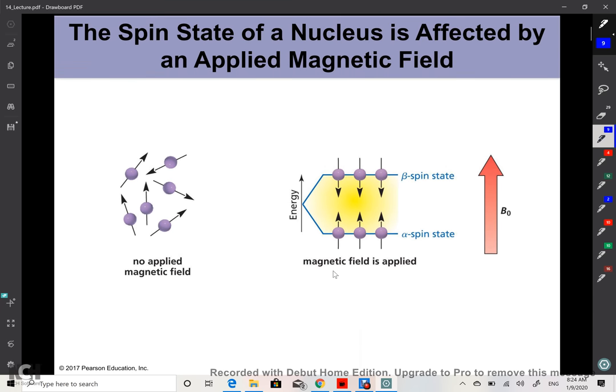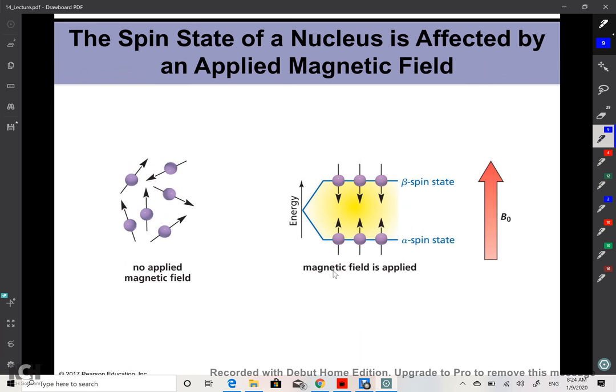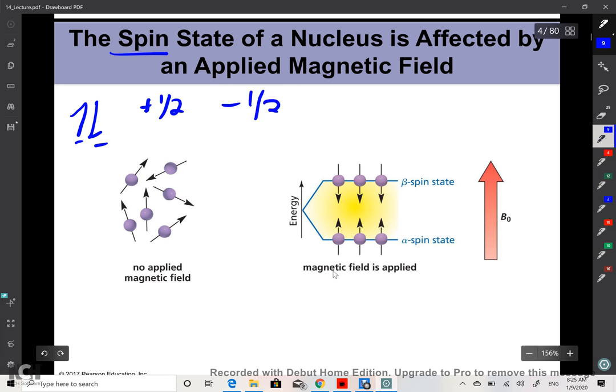Principle of NMR, how does it function? When we talk of these nuclei, the nuclei have what we call a spin. The best way for me to represent that spin is, let's think about the electron. We usually say the electron can either be pointing up or pointing down. You remember when we used to do electronic configuration. So technically, these are what we refer to as spin. When an electron is pointing up, we sometimes refer to that as a plus 1/2 spin. You remember that in 201. And when the electron is pointing down, we refer to it as a minus 1/2 spin. Is that okay? I think you guys remember it in 201.